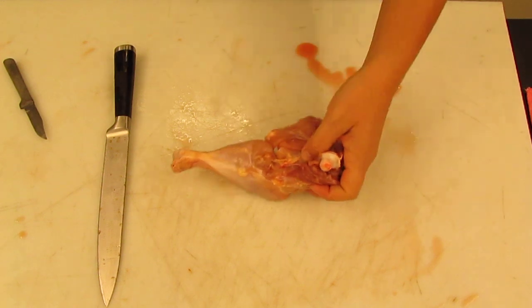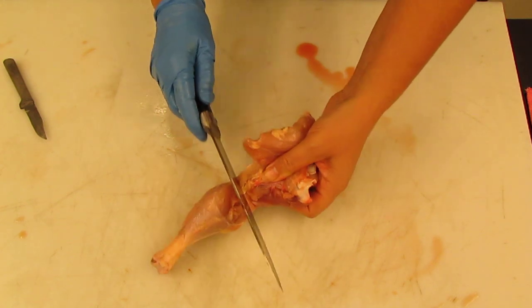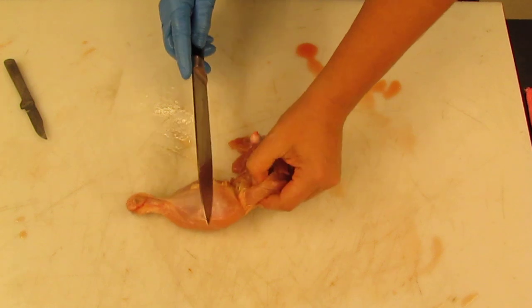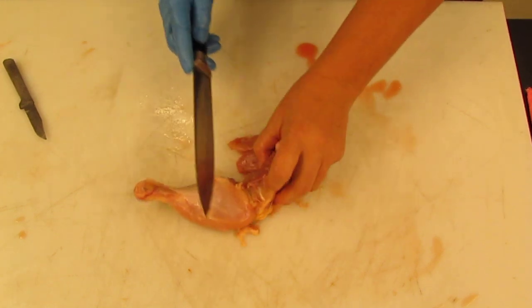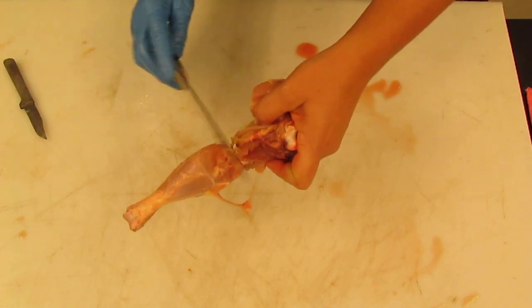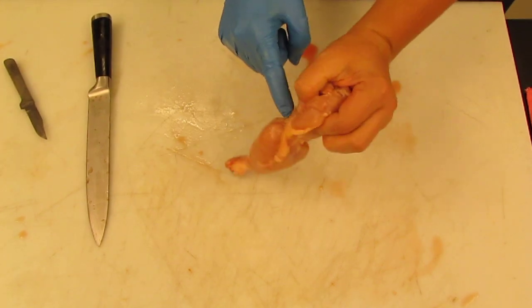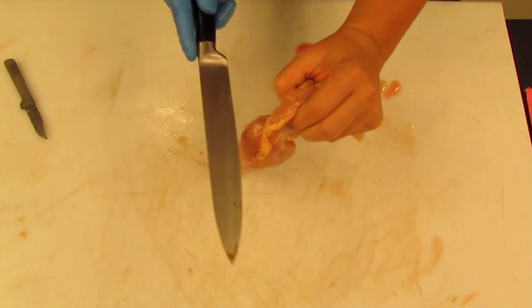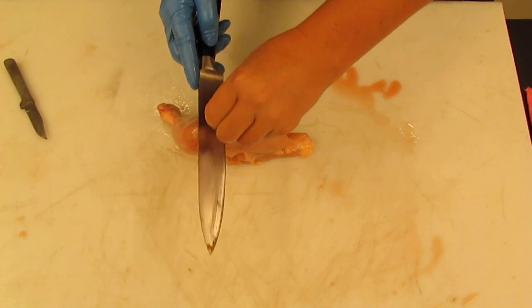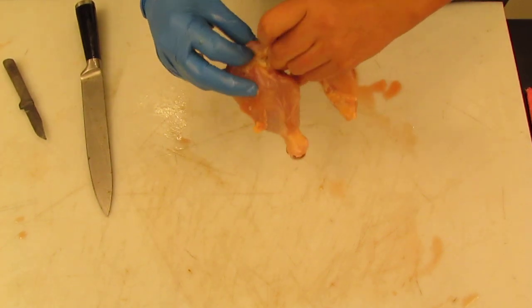Okay, so at this point I want to go even deeper to try to actually see this joint, so I'm going to cut away all of those things that I just showed you to expose the joint. And again, I'm just cutting along the natural lines in the muscles. Nice and gentle, don't want to nick the knife or the bone or me. None of those things are very good, right? All right, the other thing is that I would like to find the patella, right? So it's part of the knee joint right here. Again, be very careful and start to remove the hamstrings and the quadriceps femoris.